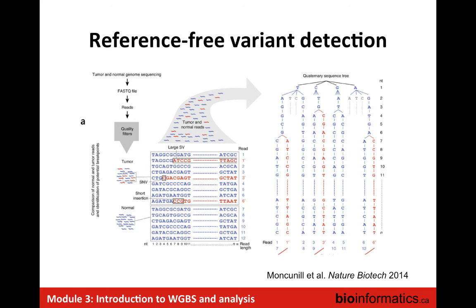That's right. Because if you're not doing it read by read, maybe with multiple reads... One challenge, for instance, if you're trying to detect, and this was also for indels, which is the same type of problem, is that mapping the individual reads on the genome is difficult. Same with methylation or indels. The individual reads are difficult, but once you've pulled all of them together, you can build a larger context of what's really happening there, and then you can map that on the genome.